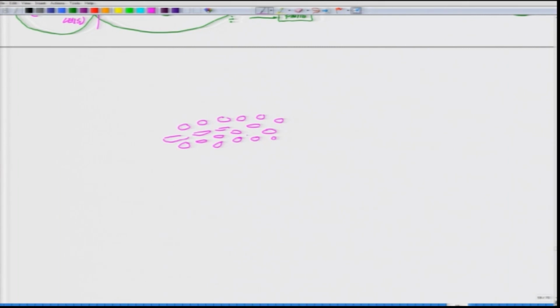So, here what you did in the first case study was put the peripheral neurons first, followed by Schwann cells second. You can reverse the order.